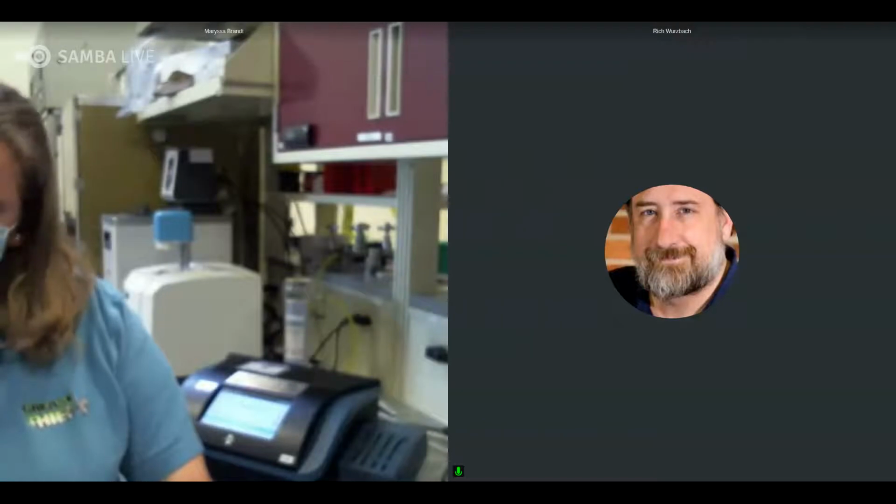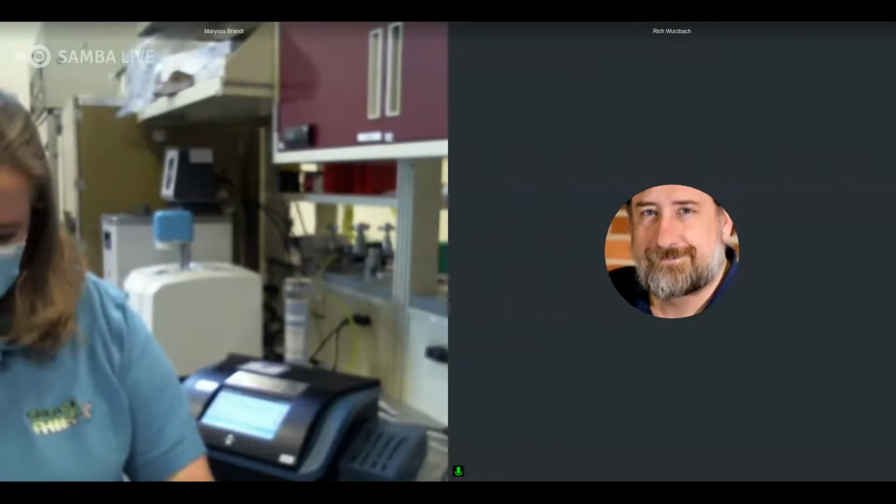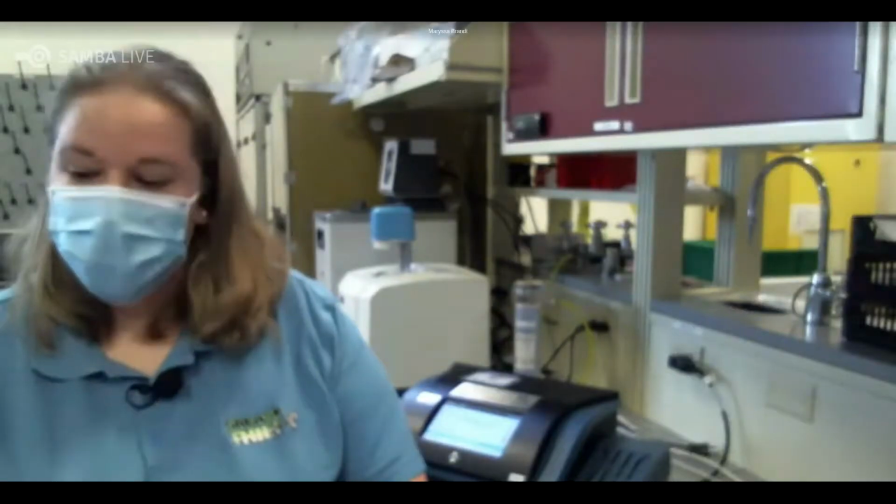Okay. How do you store or handle the vials, the septums, and the caps so that they have no moisture contribution before you add the sample, right? So you just showed the microcapillary and you added that in with a known amount. So what are the steps that you take so that it doesn't already have a certain amount of moisture in it and that gets counted as well? Right.